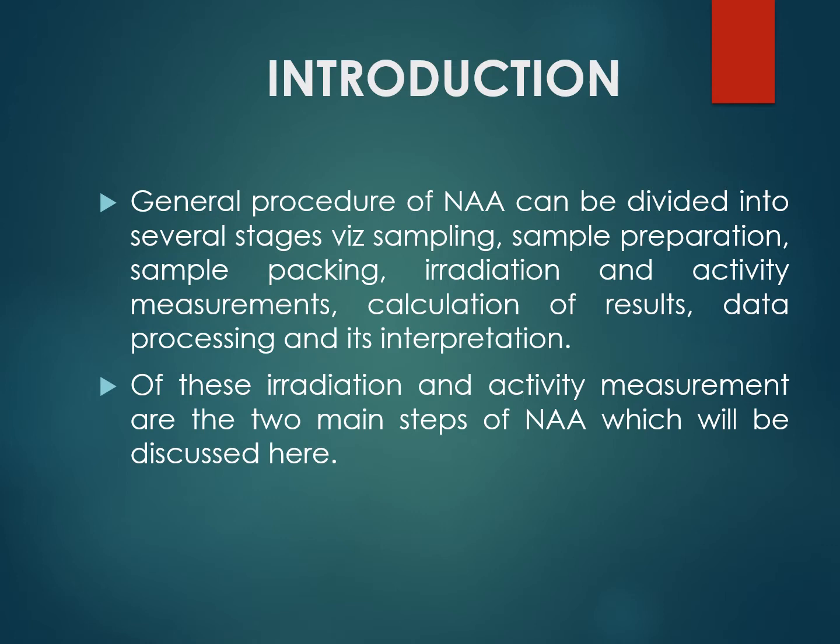In this way the labeling is done and water is collected, and when we put that specific sample into that specific apparatus or test tube or cuvette, we will also label it accordingly. Then we will take that sample to our laboratory and make different preparations of the sample by using different sampling techniques, and we say that this is the sample preparation procedure.